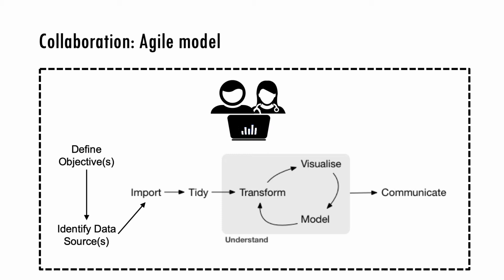So in our experience at CHOP, data analysis works a lot faster in general if everyone can look at the narrative that explains the analysis, the code, and the results from the code at the same time and interact with the data in real time. And this is made possible with the use of computational documents. R Markdown is an ideal framework for that kind of collaborative data analysis.